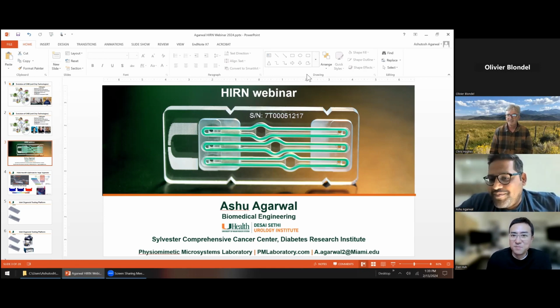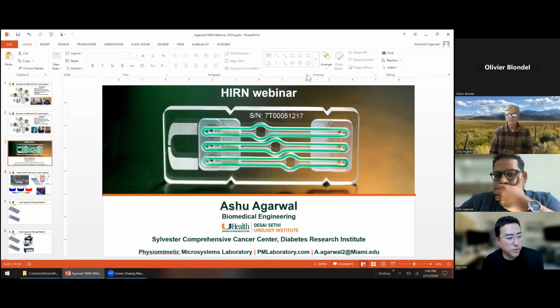Yes. Just to add, we think similarly, and so the autologous models would be ideal, especially for the purposes of studying islet-immune reactions. But like I said, we've tried it, and it's not the easiest thing to do. So this is a more experimentally controlled and tractable system that we're using, based on CAR-T techniques.